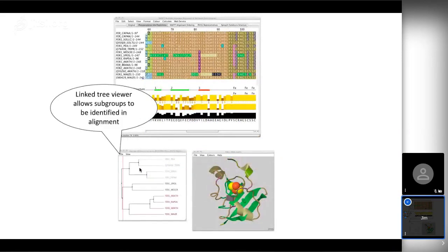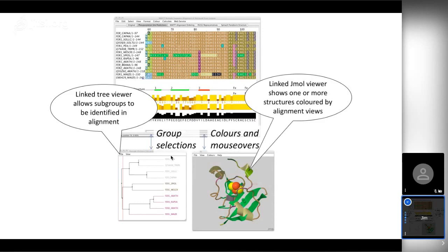The tree viewer works with the alignment by linking the rows in the alignment view with the nodes of the tree. You can click in the tree viewer and that will subdivide the alignment according to the topology of the tree — in this case into three different groups. You can select sequences according to the tree. The structure works a little differently: if you move the mouse over the structure, the position in the alignment corresponding to positions in the structure under the mouse will get highlighted. You can also propagate the coloring from the sequence alignment to the structure, allowing you to map conservation onto the structure automatically.